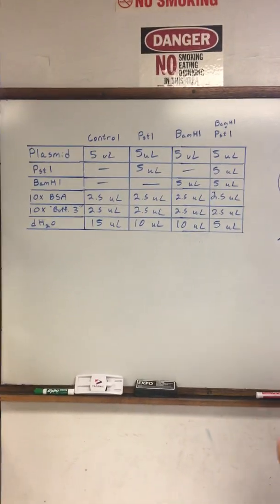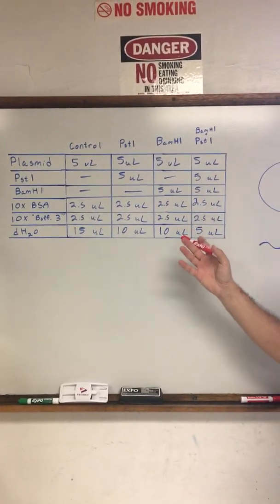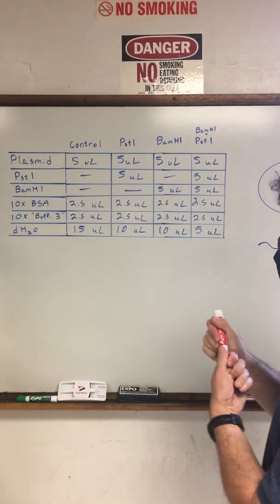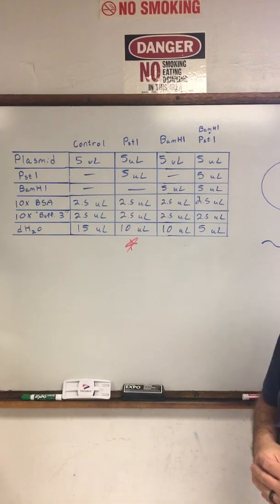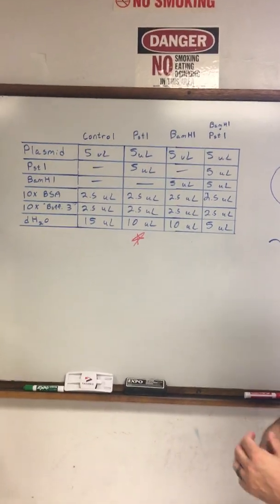Okay, so rather than go through all of these reactions for you, I'm just going to choose one of them. So I'm going to be doing, let's do this one here. This will be a single digest using the restriction enzyme PstI.